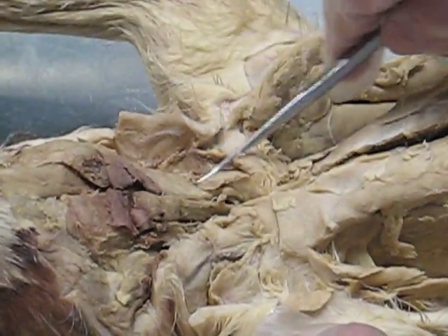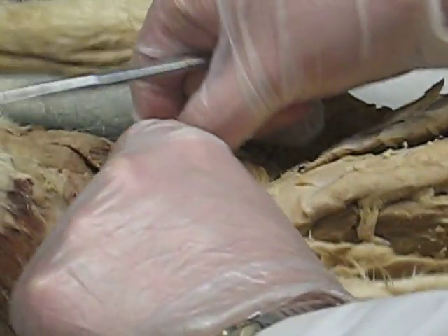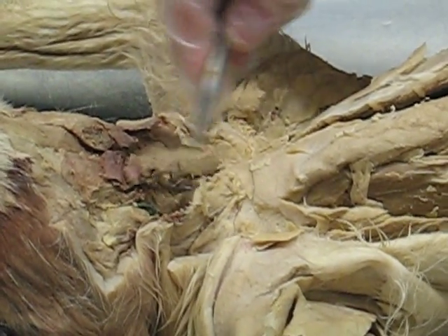You can see the sternomastoid and the clydo. Just know one's closer in — the sterno is closer in and the clydo is further out. So these are the sterno and clydomastoid, the v-neck collar. And then you have the muscles. This is the sternohyoid.